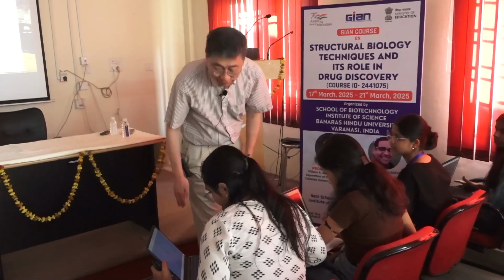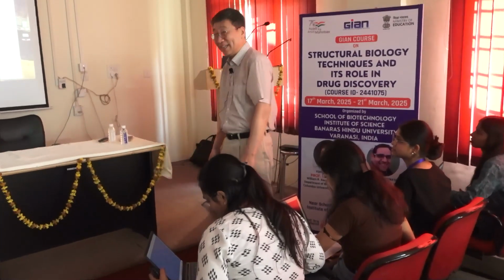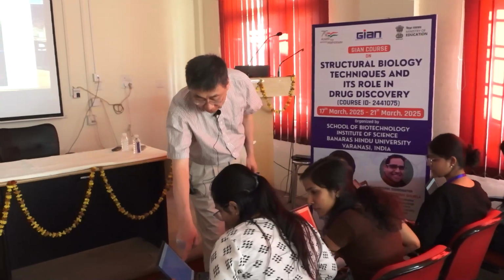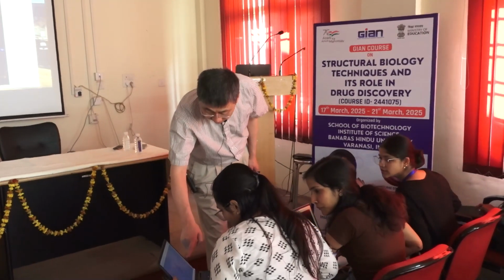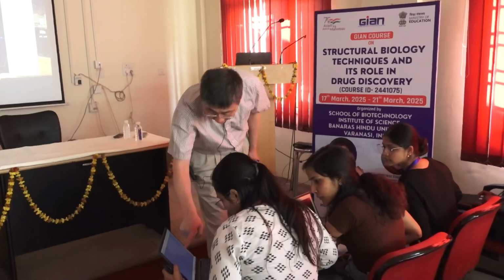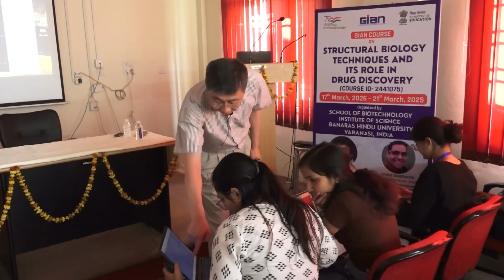Yeah. So now, can you zoom in? Zoom up a little bit? Oh, you're good at trackpad. That's great. OK. Zoom in a little bit. You can see the valine. Right? Zoom in more. Yeah, there you go. See, and that's the actual density right there.